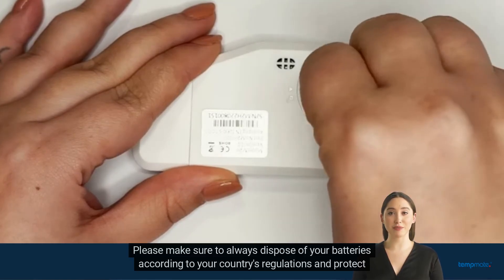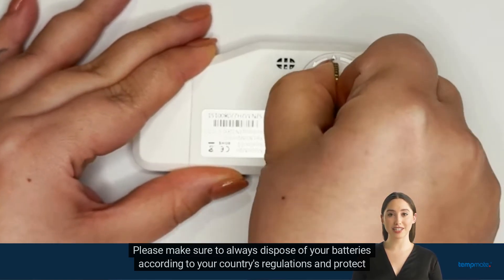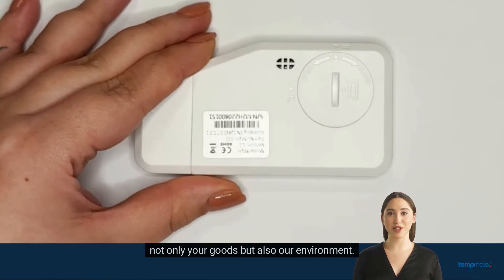Please make sure to always dispose of your batteries according to your country's regulations and protect not only your goods but also our environment.